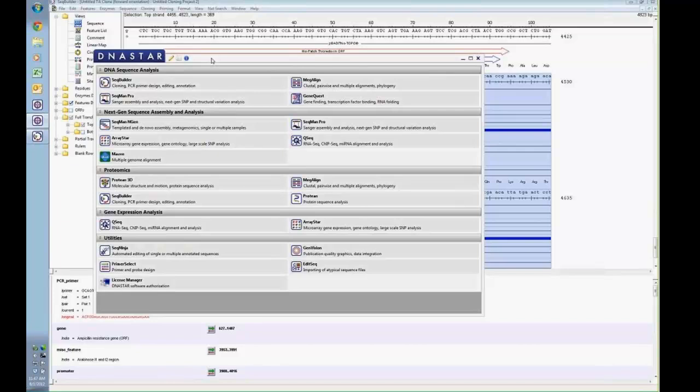Great. And then another question, is it possible to create an antisense construct using the software? Okay. So if you wanted to create an antisense, I can simply highlight a selection and do a reverse complement. In the cloning wizard, I think there's also a palette tool that gives you the option to automatically create the antisense as well. So as part of that cloning wizard that popped up that looked at the 5' ends of your vector as well as your 3' as well as your insert, it gives you some options to do a reverse complement there as well.